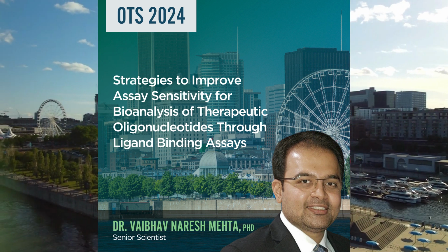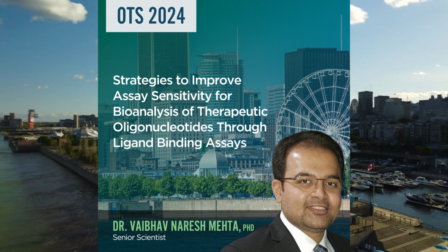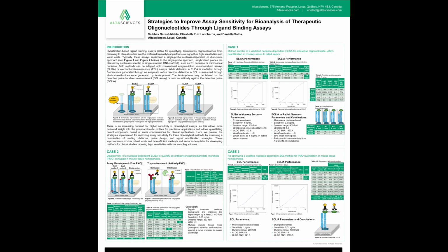I am Vaibhav Mehta, a senior scientist at Altasciences Laval, and it is my pleasure to present this compilation of work prepared for the Oligonucleotide Therapeutics Society 2024 conference in Montreal. This presentation, titled Strategies to Improve Assay Sensitivity for Bioanalysis of Therapeutic Oligonucleotides through Ligand Binding Assays, highlights 3 case studies where varying assay optimization strategies resulted in superior assay sensitivities compared to conventional ligand binding assays.